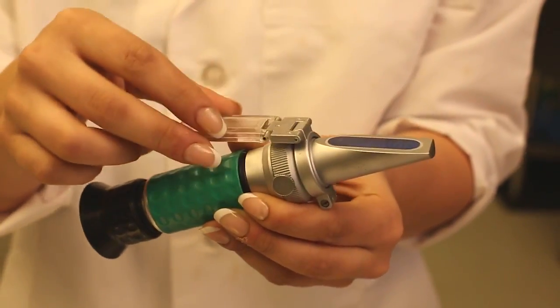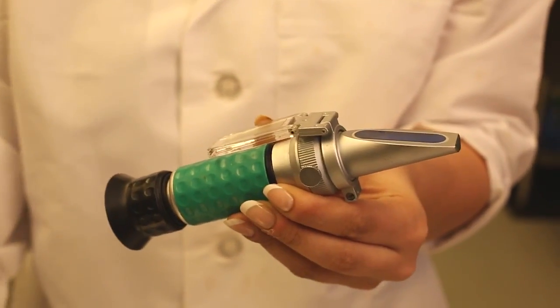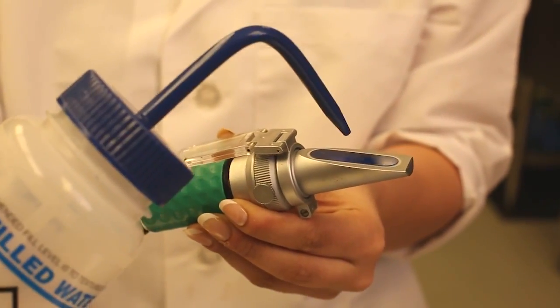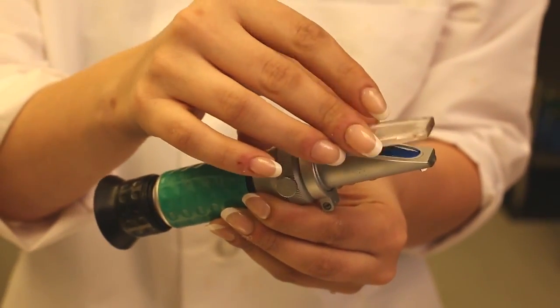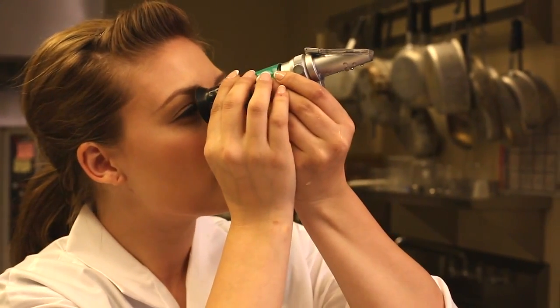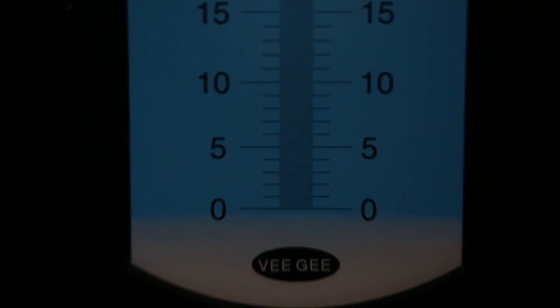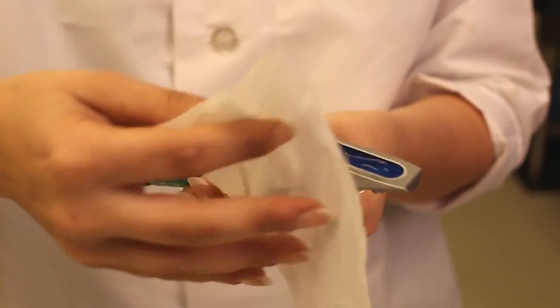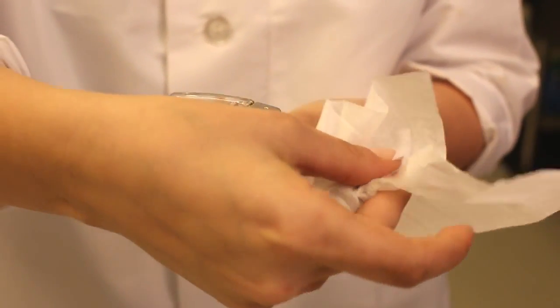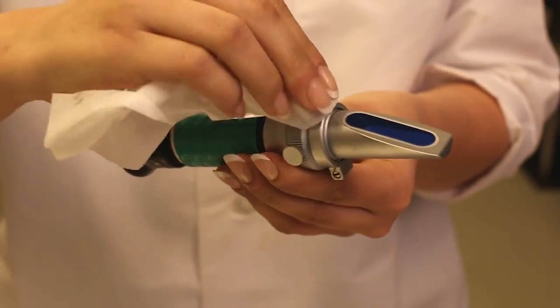Before using the refractometer unit, it needs to be calibrated to zero by placing a couple of drops of distilled water onto the prism and closing the daylight plate. Next, you should hold the unit up to the light and look into the focusable lens. It should be at zero on the scale. If it's not, there is an adjustment screw on the top to adjust it to zero. Then the prism should be wiped clean and dry with a Kim-Tech wiper to avoid scratching the glass prism.